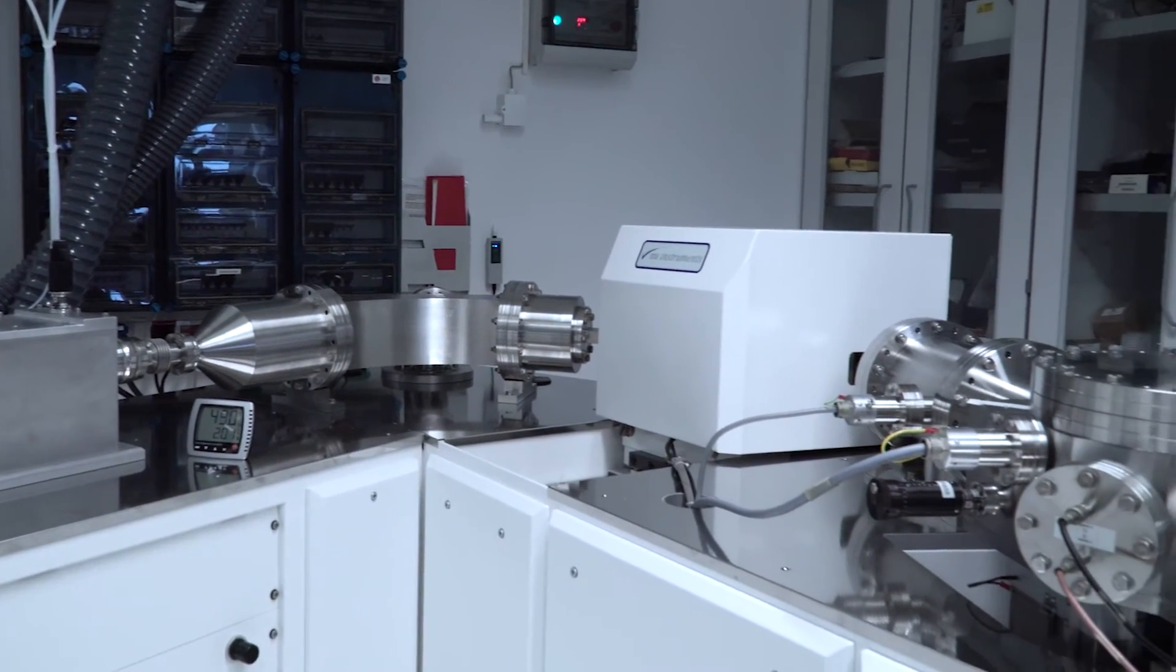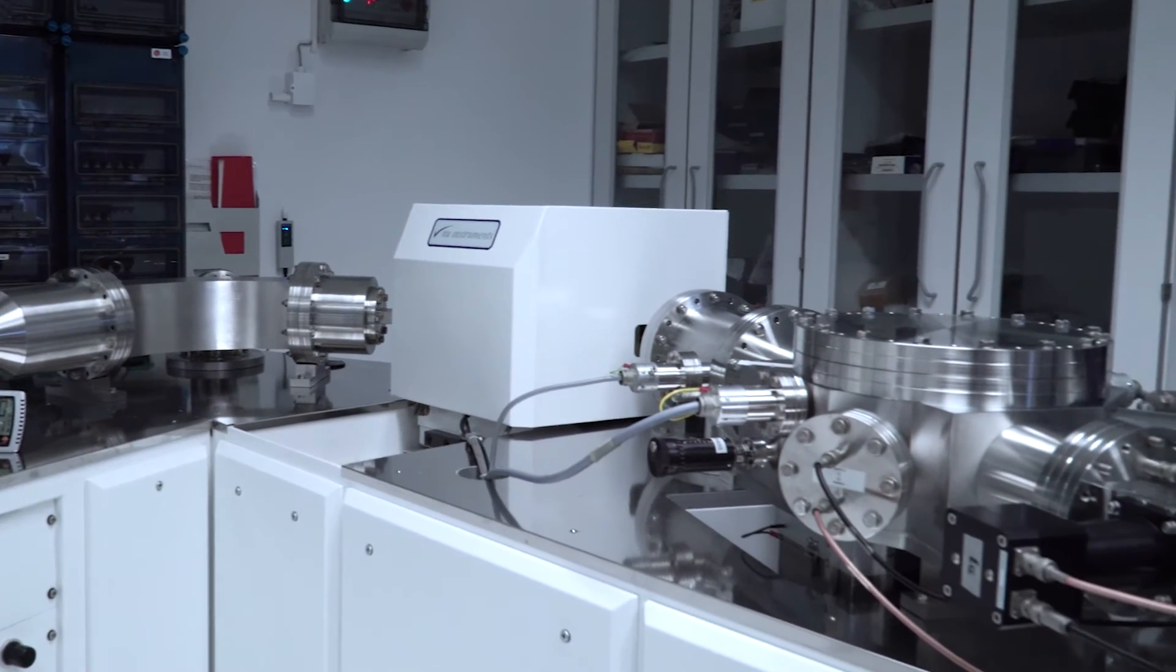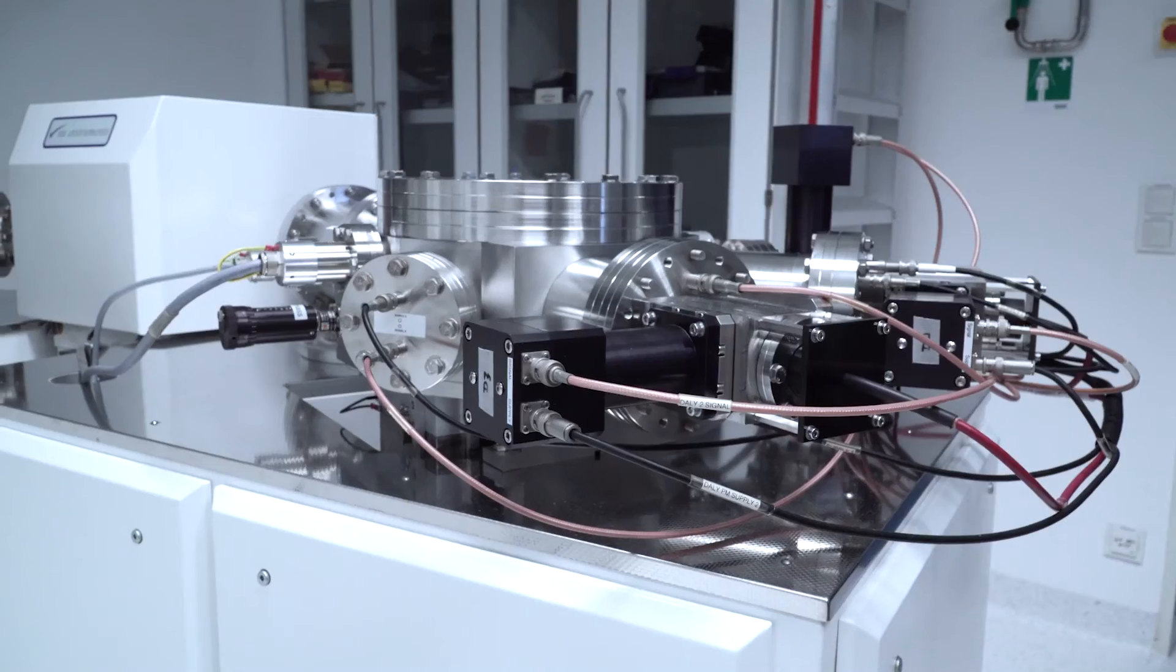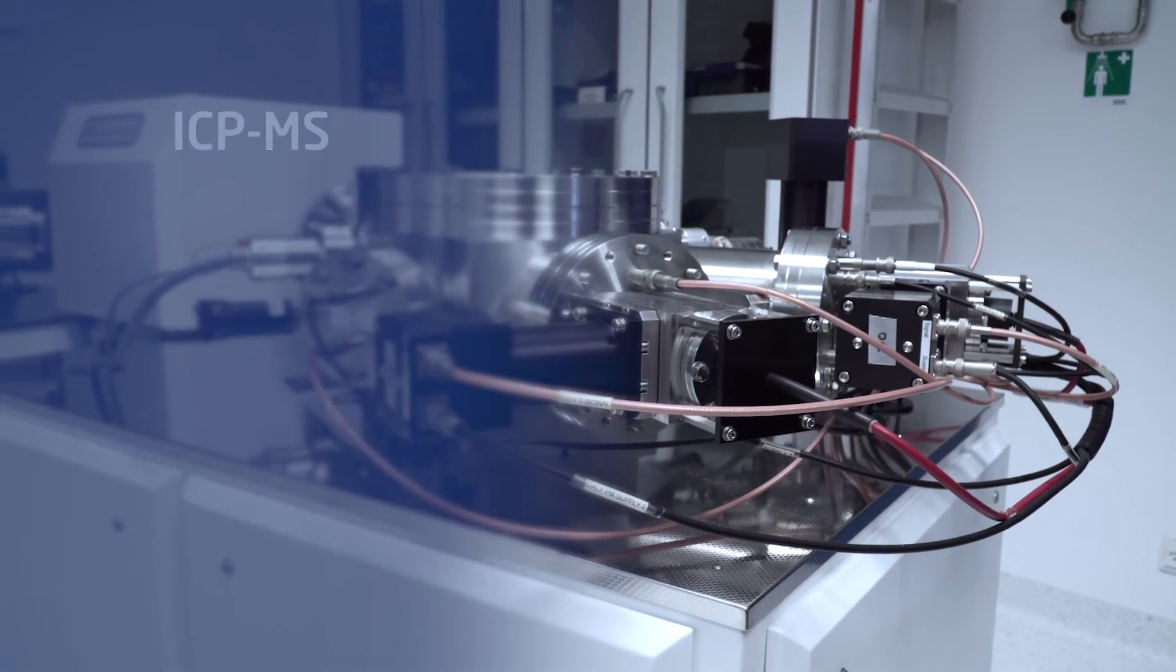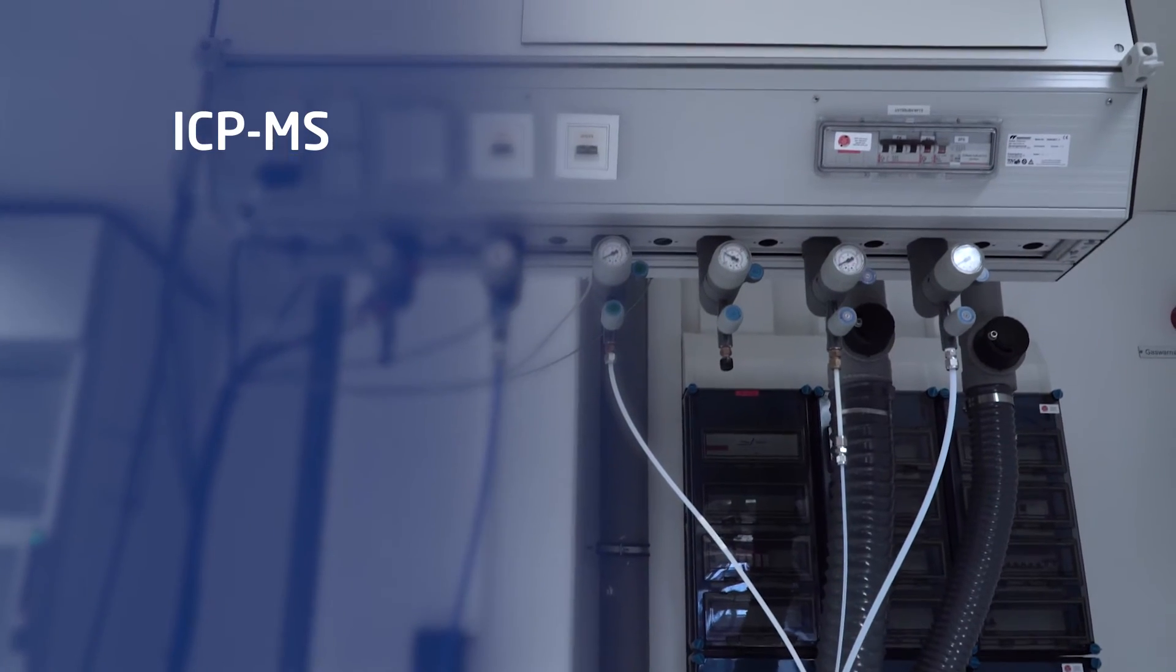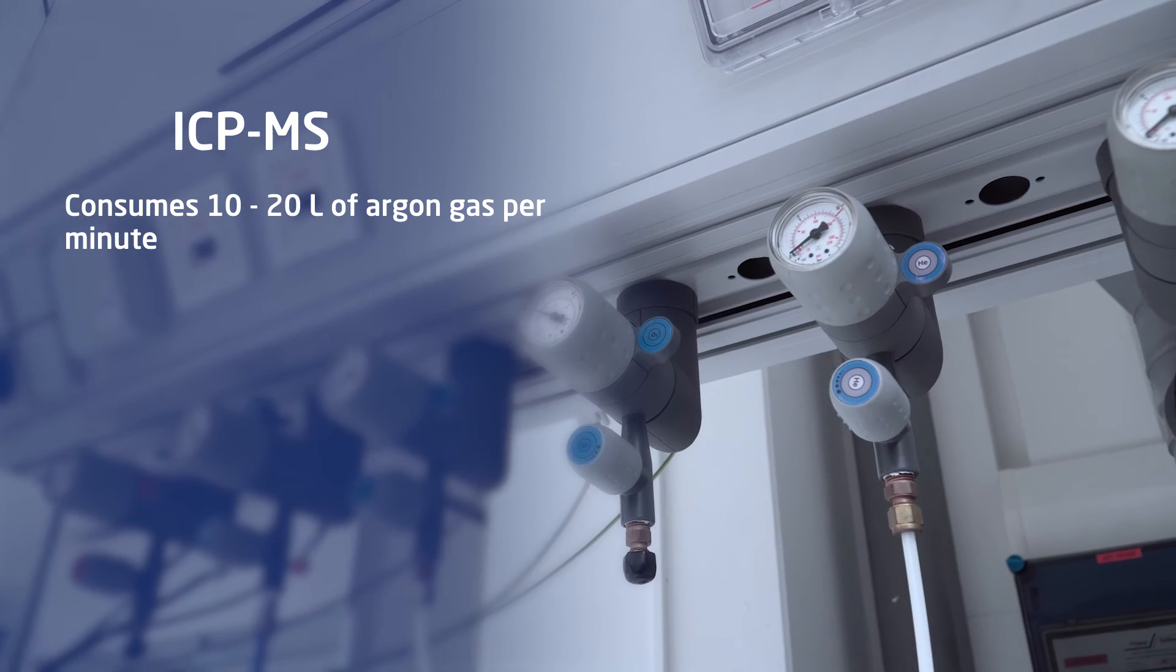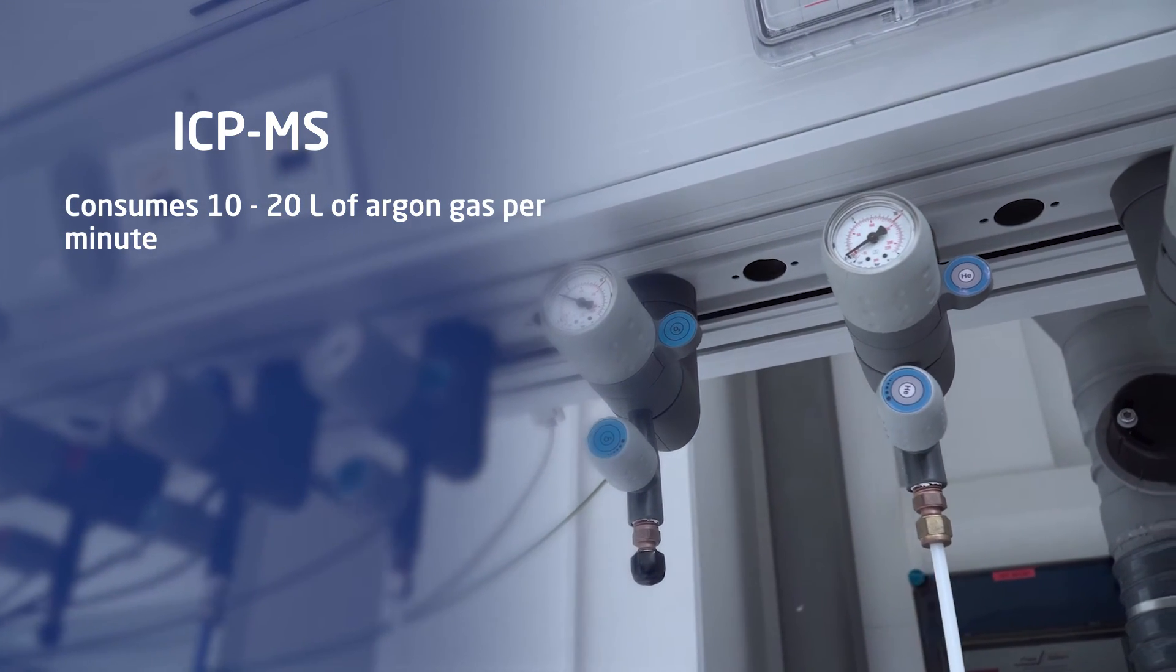The ICP-MS technique can measure extremely small concentration for some analytes, parts per trillion or even parts per quadrillion. But it is also quite demanding regarding lab requirements. A typical ICP-MS consumes 10 to 20 liters of argon gas per minute.